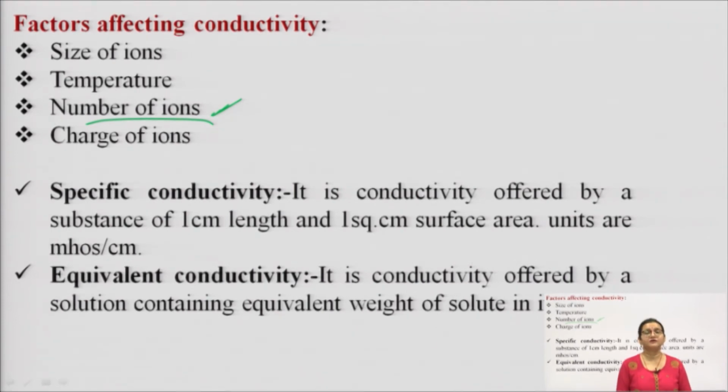Then the last one is the charges of ions. Charges of ions will definitely affect the conductometry measurements.